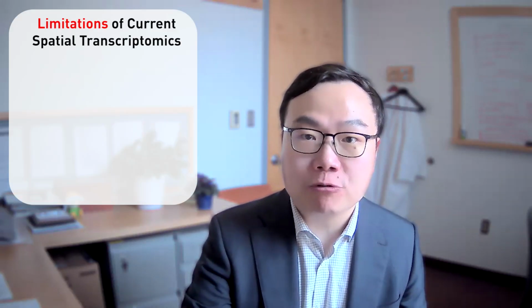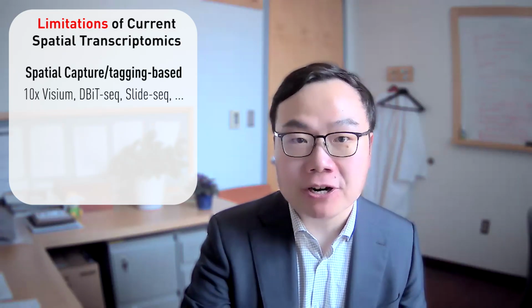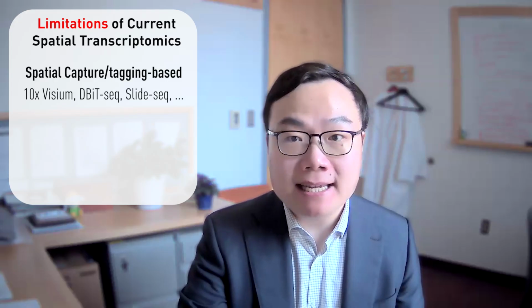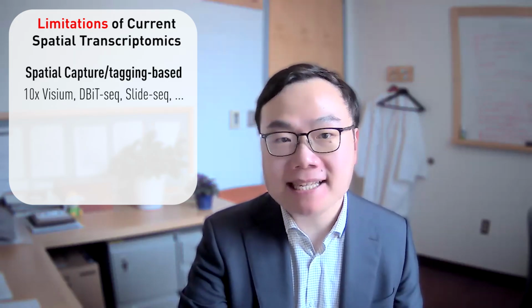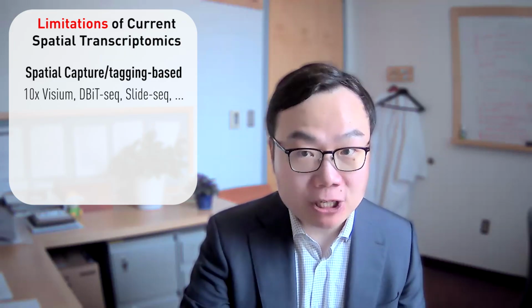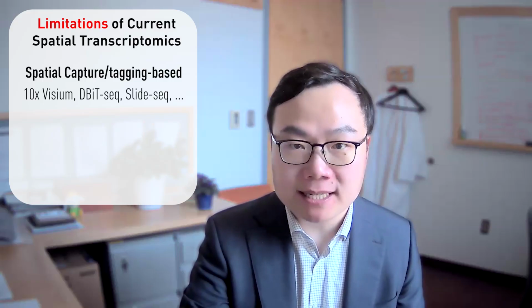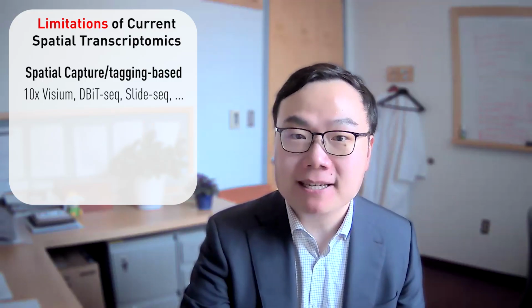There are currently two major classes of spatial transcriptomics technologies. First, there are spatial capture or tagging-based spatial transcriptomics. These techniques use a 2D array of oligos carrying X and Y barcode sequences to label transcripts from a tissue section, and then use in vitro high-throughput sequencing to read out both the barcode sequence and the transcript sequence.